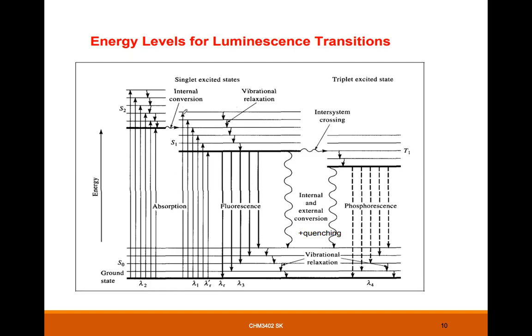Of course, it is specific, but the electron decided to slowly go down, like going down some small steps first, before it goes down to the ground state. So the energy level of the electron is different from the energy level that was absorbed before it got excited. That's why you see the lambda is different.